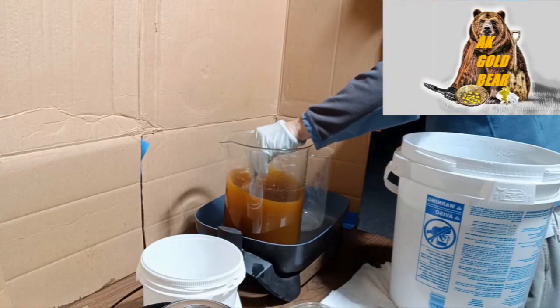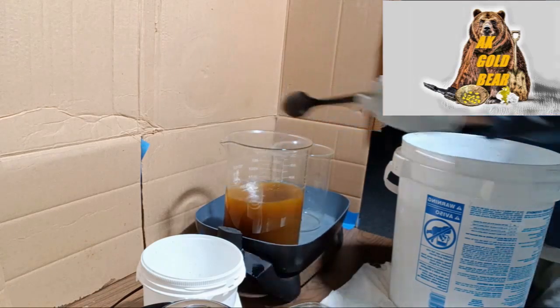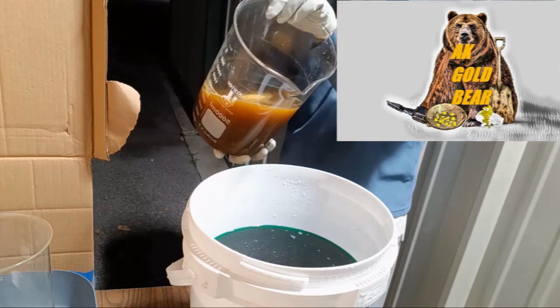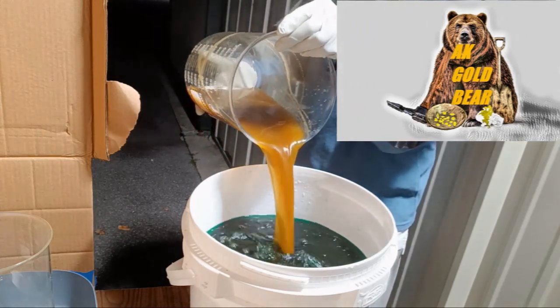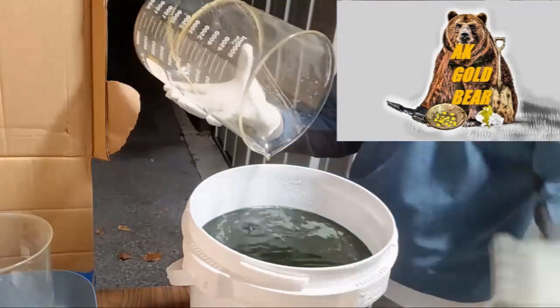I will precipitate gold today with iron sulfate. My iron sulfate is very old, which is why it looks very brown and rusty. But the old iron sulfate works just like new one — absolutely no problem.